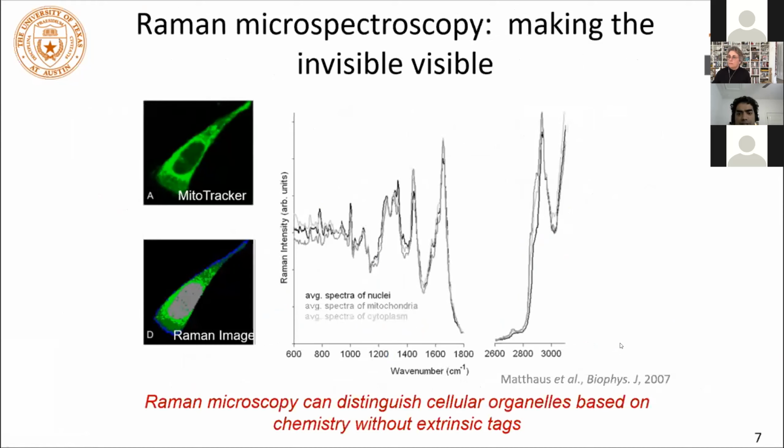And so this is an older example, and I like it because it's one of the original ones, but there are many more that have happened since then, where many other organelles have been tracked, all of them using a variation of the same idea, right? So this idea of a lot of unsupervised learning, or maybe even supervised learning, has become very popular in the recent 5 to 10 years with machine learning.